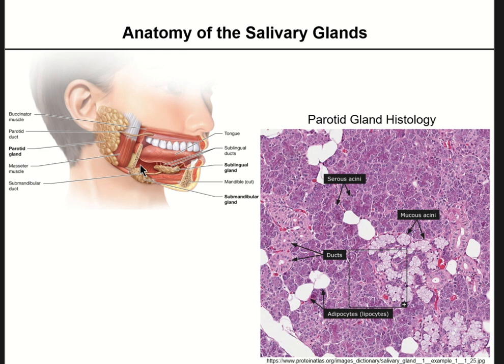Endocrine releases hormones into the blood, but exocrine glands are going to release secretions through a duct and out into a space or some sort of area. And so that's what these guys are going to do. The salivary glands are going to gather these secretions produced by these serous and mucus cells and route them through the ducts and out into the oral cavity. So anytime you see these circular, simple cuboidal cells, you can pretty much tell, okay, that's going to be like a duct.